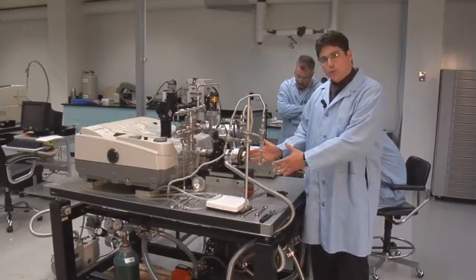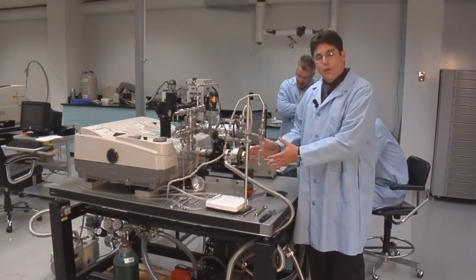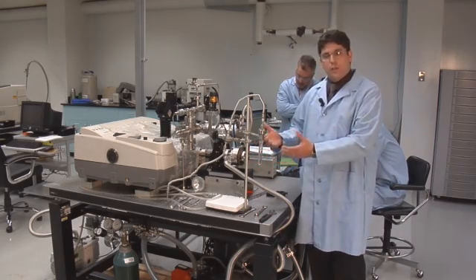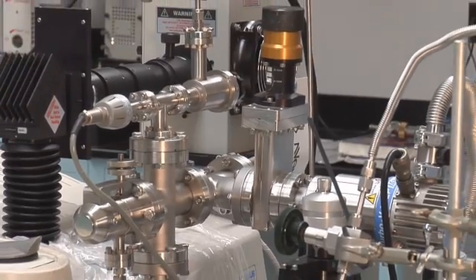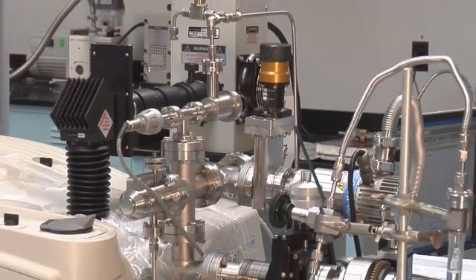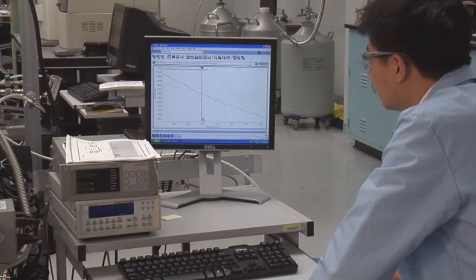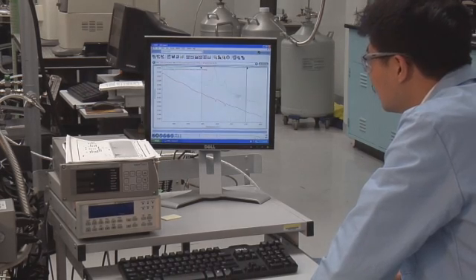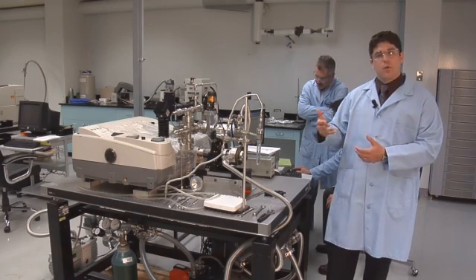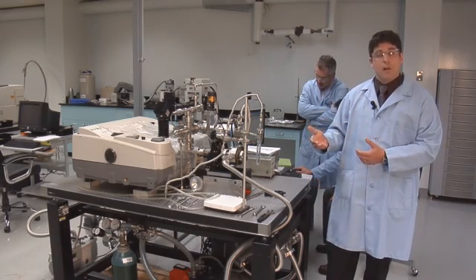We've designed a special system here that allows us to control the atmosphere for the reactions that we run, so we can control the amount of CO2 that we use during reactions. And then we use what's called Fourier transform infrared spectroscopy to monitor the reaction and to look at the disappearance of carbon dioxide and the appearance of the products that we make, things like methanol and methane.